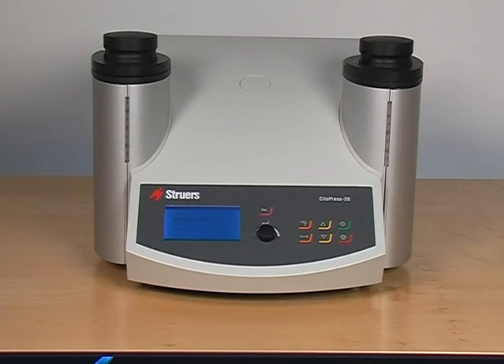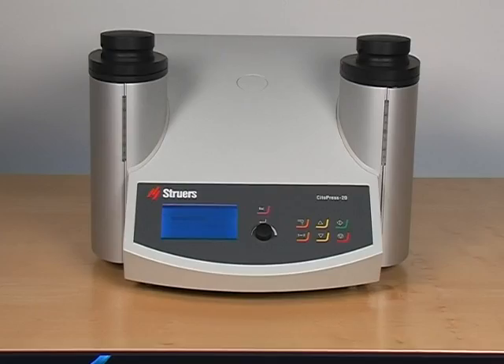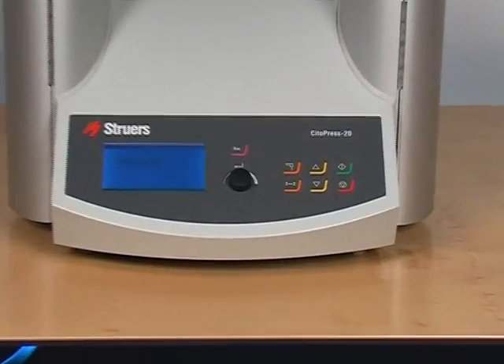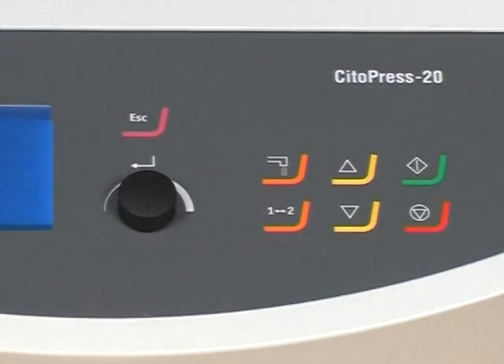The new CitoPress comes in three versions, which all are automatic and share a unique design which is built to last. CitoPress-20 with two cylinders and the possibility to add options, including automatic dosing.